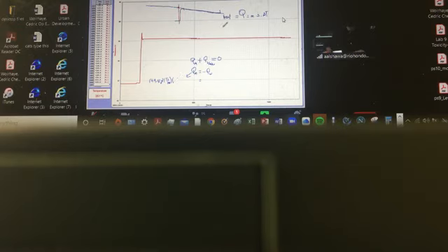What was the initial temperature of the metal? Because I want to figure out delta T for the metal. Delta T is always T final minus T initial. What was the T initial? What was it? 21.3 or 2, you said, right? That's water. The initial temperature, I'm sorry.